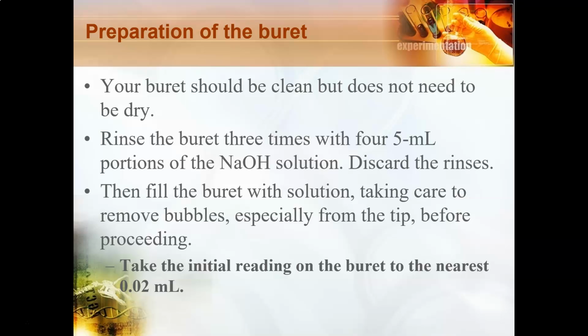Then you'll fill the buret with the solution, and you want to make sure you remove the bubbles, especially from the tip, before you proceed. You might want to get some help from either your lab professor or the teaching assistant. We're pretty good at spotting bubbles in the burets, especially in the tips. We have a lot of experience with this. If a tip is completely full of air, it might look like it's full of solution, so we can help you with that.